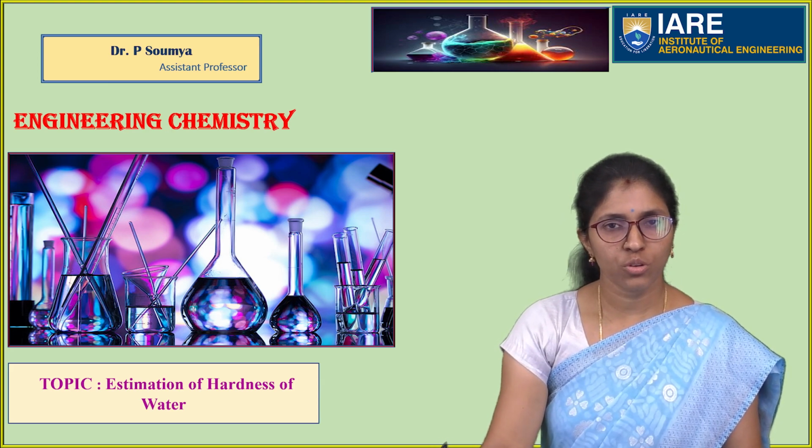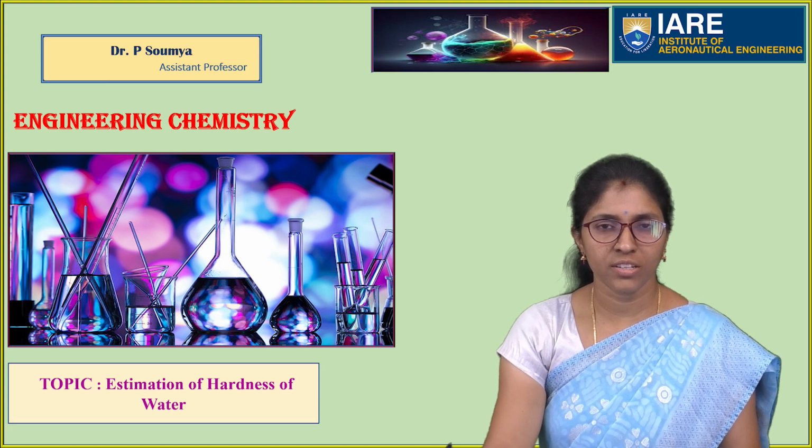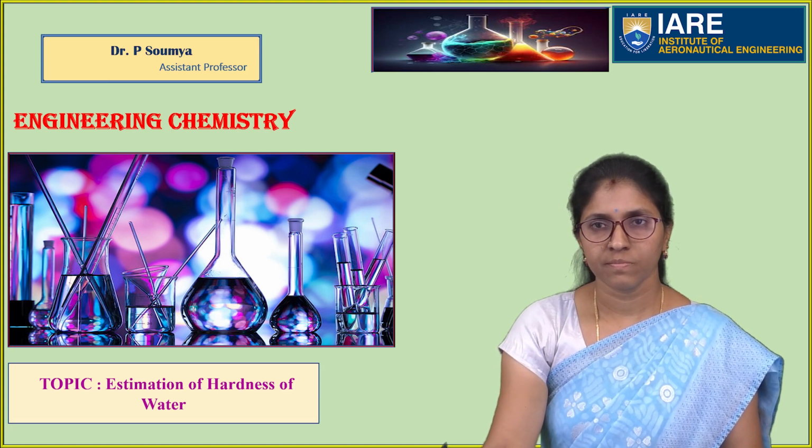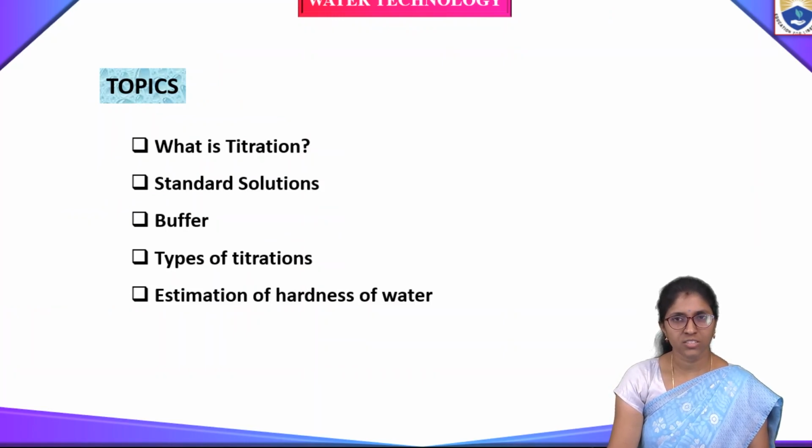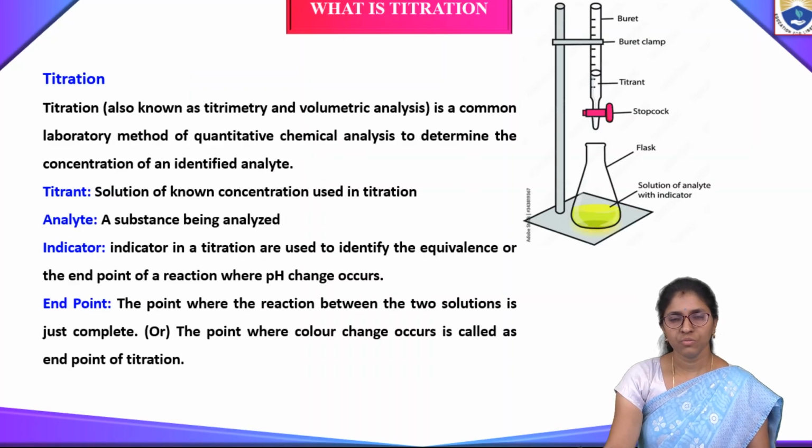In this session, I'm going to discuss the estimation of hardness of water. We will cover what is titration, what are standard solutions, what is a buffer, types of titrations, and finally the estimation of hardness of water by using complexometric titration. First we should know what is titration.